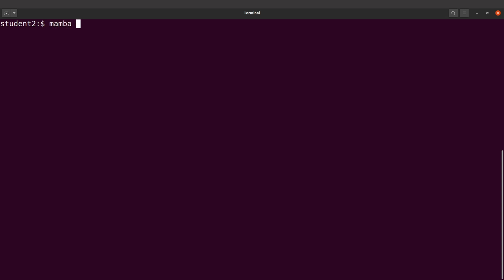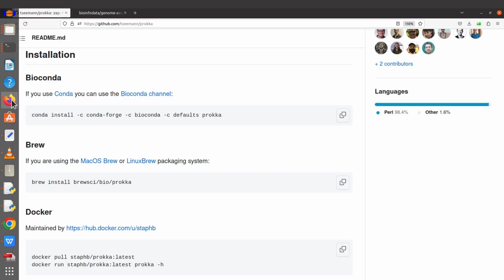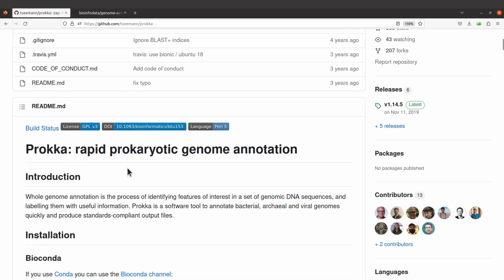So I will say mamba create -n, and I'll say prokka. So this command is used to create an environment. The environment's name is Prokka. Now I'm going to specify some additional information. So I'll indicate the channel. So I'll say -c bioconda, -c conda-forge, and then I will say -c defaults. All right, so like this. I'm following the instructions that has been indicated on the Prokka GitHub page.